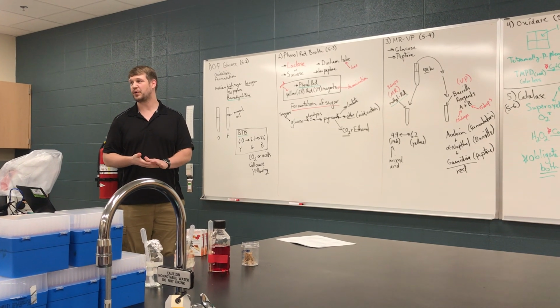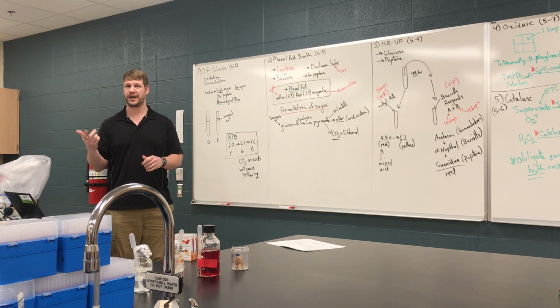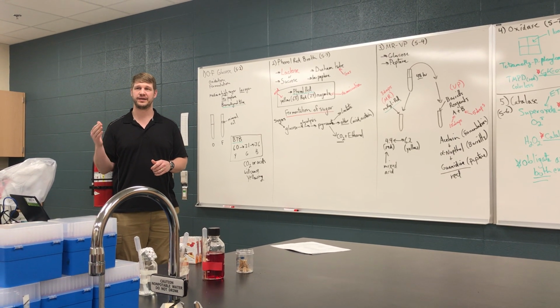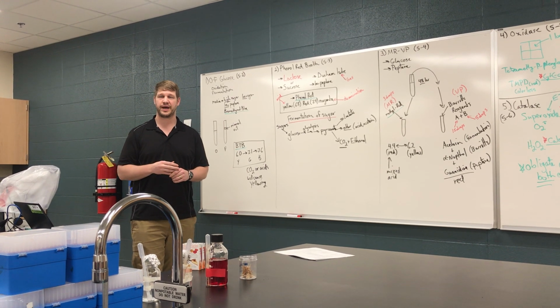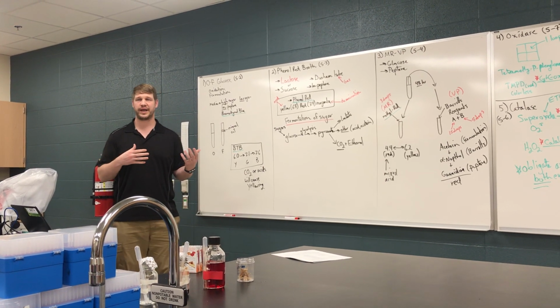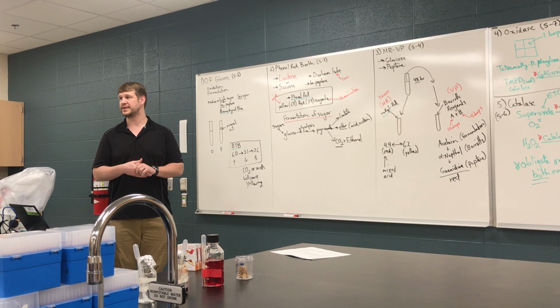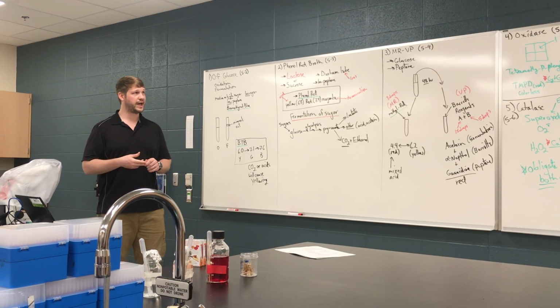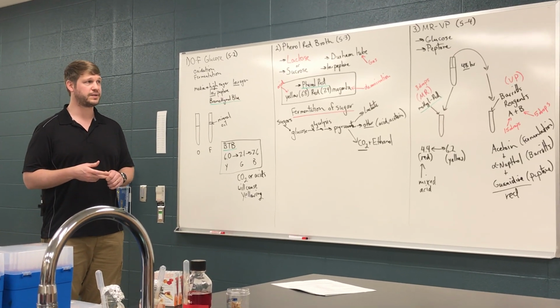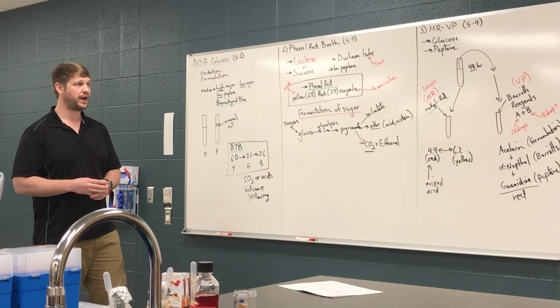As mentioned in class this morning, we've got two things we're doing today. One is going to be inoculating a variety of different media with your two knowns and your two unknowns. A lot of these are just looking at the metabolic capacity of each of those four organisms, telling you about either their ability to utilize a particular substrate or to produce a particular byproduct.